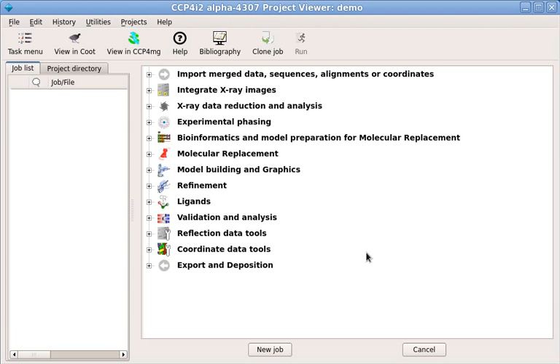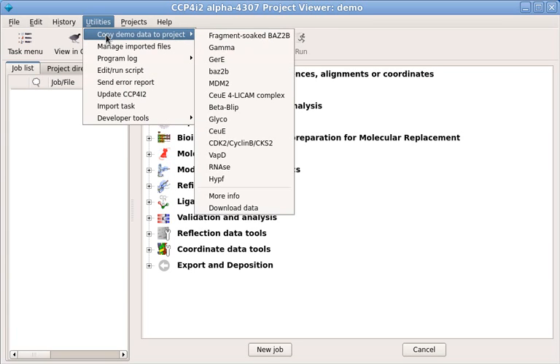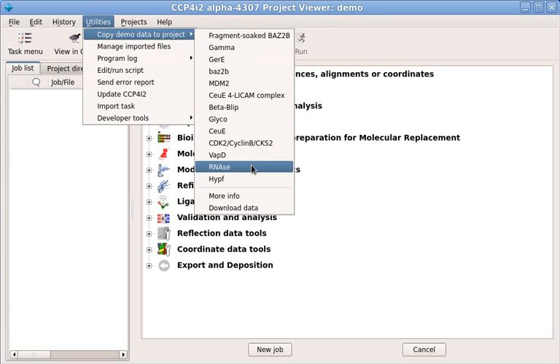You can reopen this window in future using the projects menu. To start, we'll need some data. Demo data sets are available under the utilities menu. We'll use the RNase data.